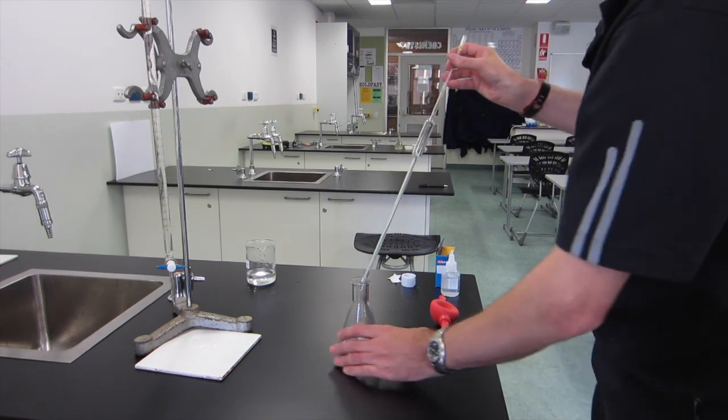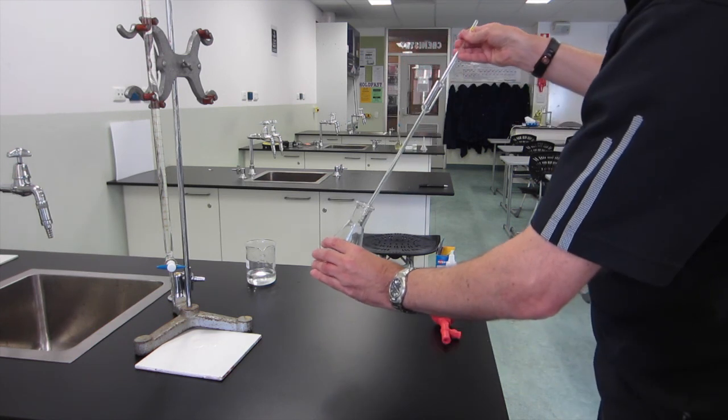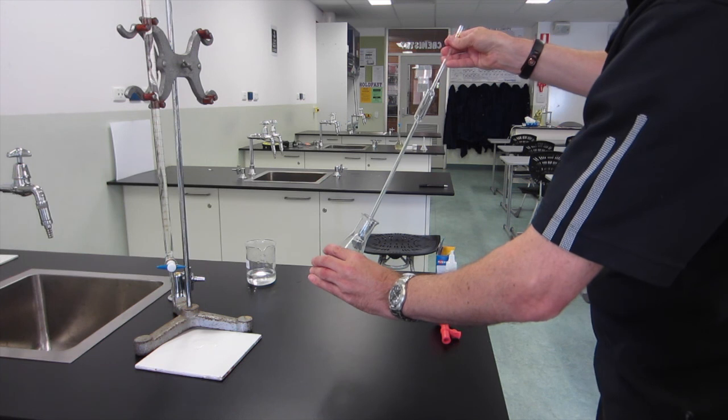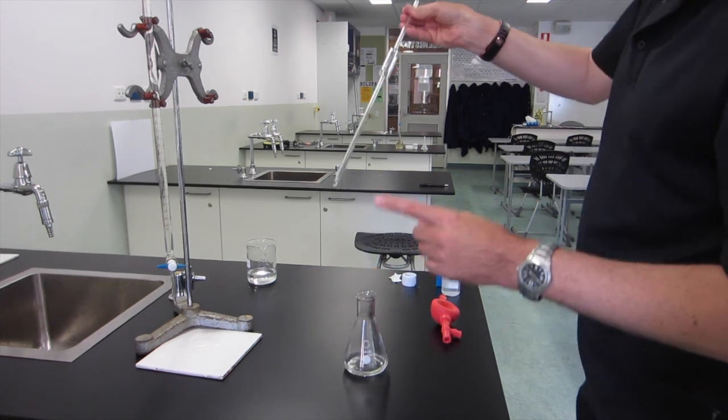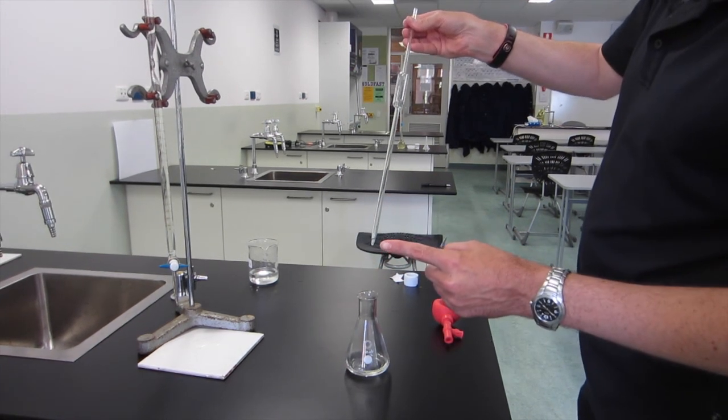As it drains out, it will get down to the bottom. Gently tap it to the side of the conical flask to remove any last drops on the end. There should be one drop remaining in the bottom of the pipette, leave that there.